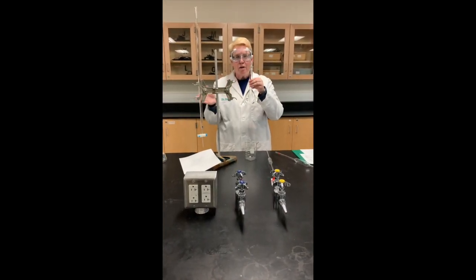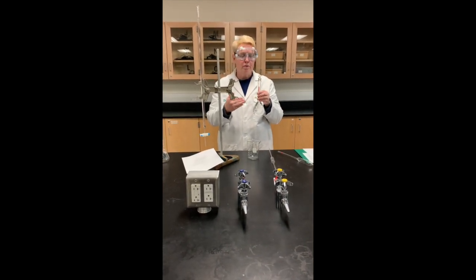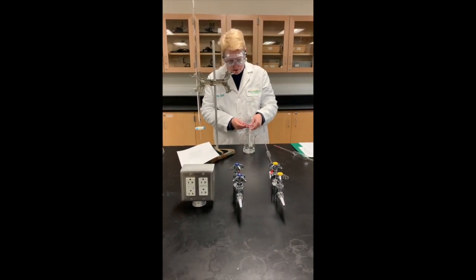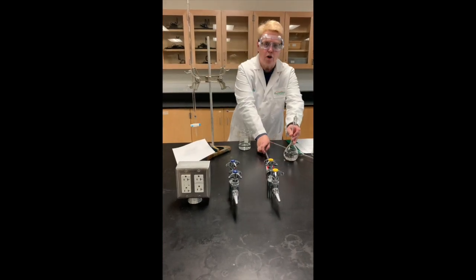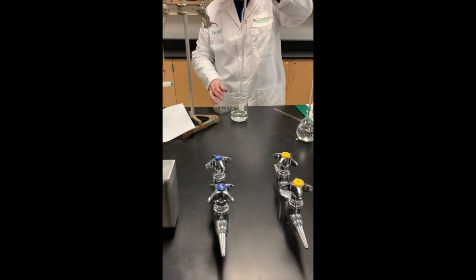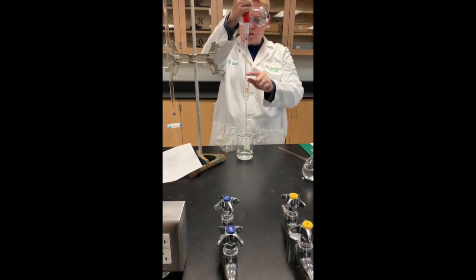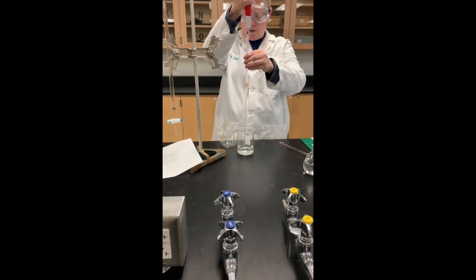Now, when we titrate, we're not going to titrate all 250 milliliters. What we're going to do is only take a 25 milliliter sample. So I'm first going to pour some into a beaker because it's easier to pipette from that. And so I pour some of this into my beaker. And now I'm going to use a volumetric 25 milliliter pipette. And so we're going to go ahead and use our pipette pumps, where we use this and suck up the liquid. And once again, just like the volumetric flask, there's a mark on this. And you want to pipette up to that mark and not go past it.